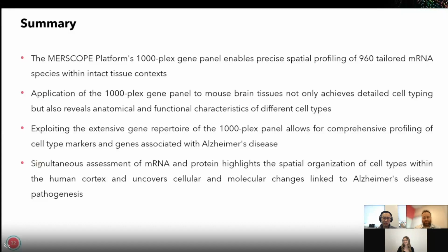I can take this one. The Merscope slide actually is much larger than the 1 square centimeter. For example, if you have a 2 to 3 square centimeter tissue, you can put it on the Merscope slide. But as mentioned, the final imageable area is limited. For example, if you have a cancer tissue or other relatively big samples, like big brain samples, you can put that on one Merscope slide, but during imaging, you can select multiple regions from the whole tissue, up to 1 square centimeter.